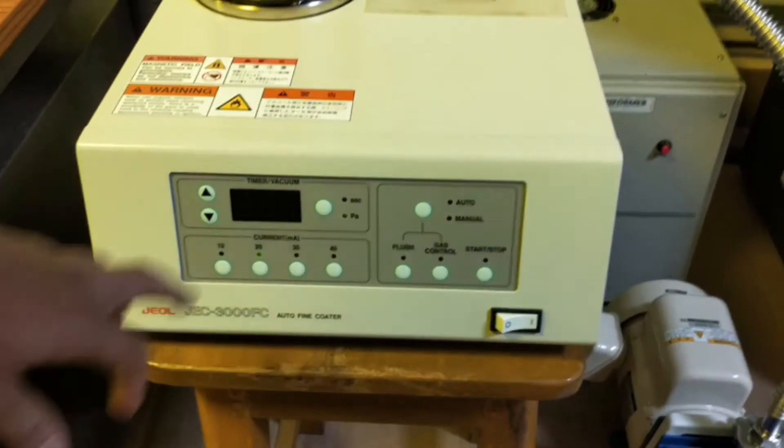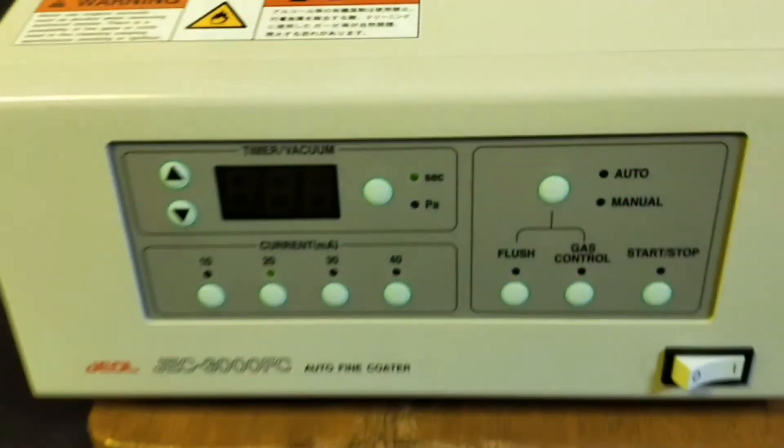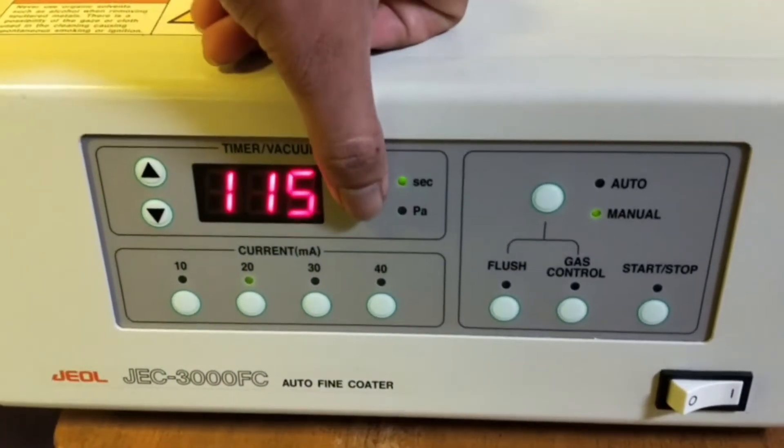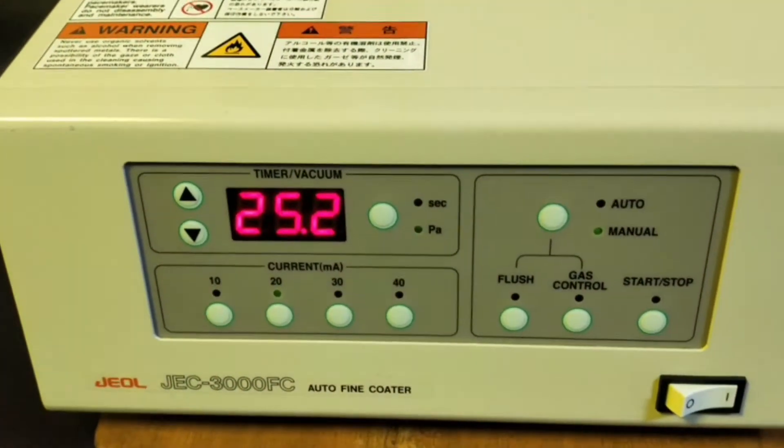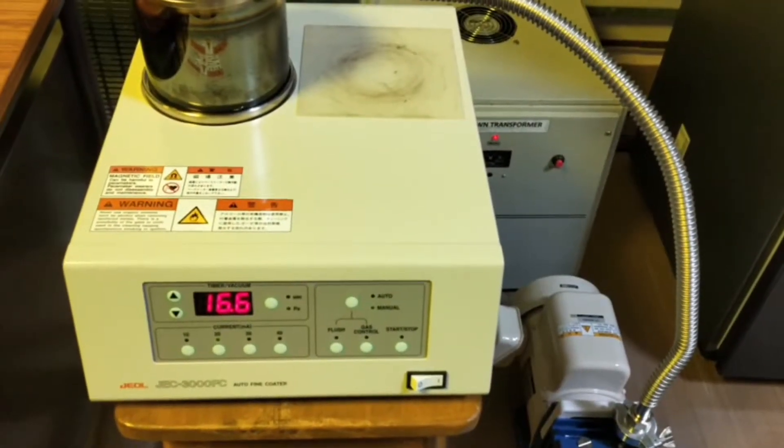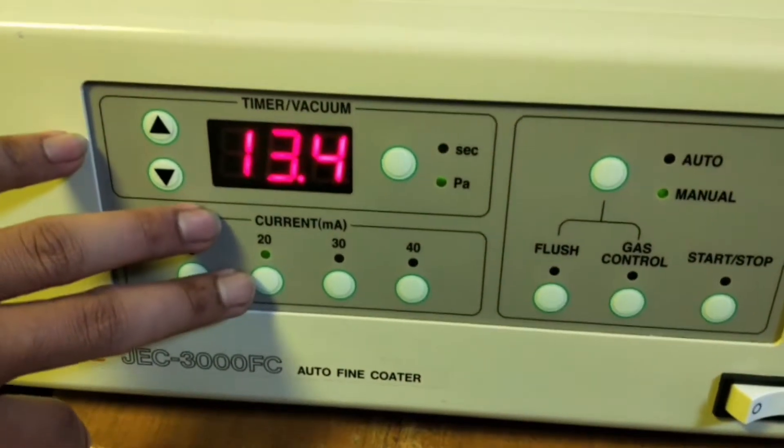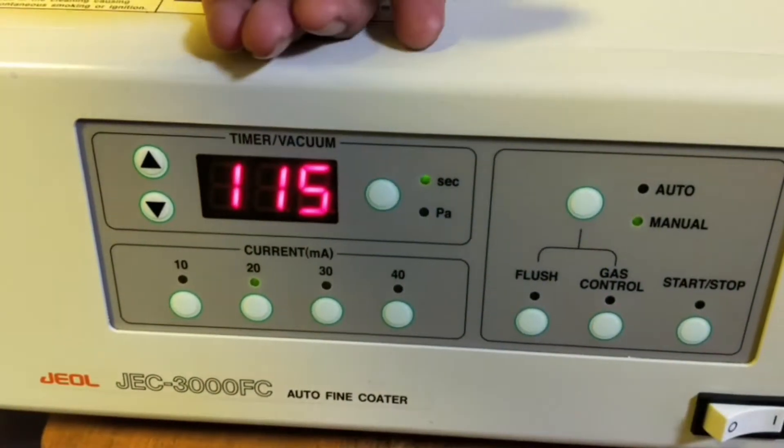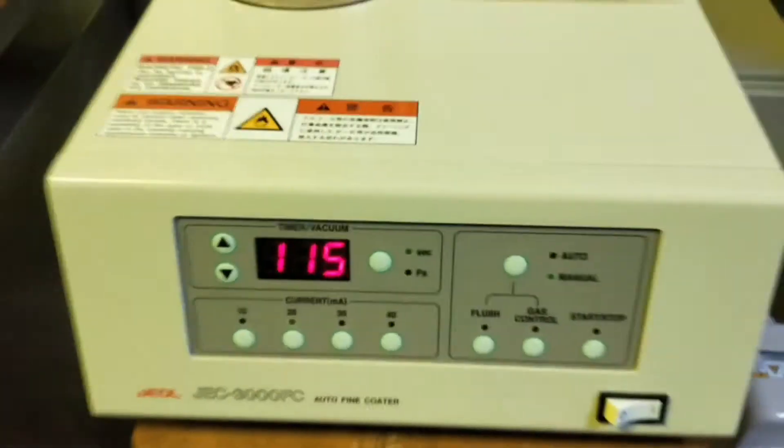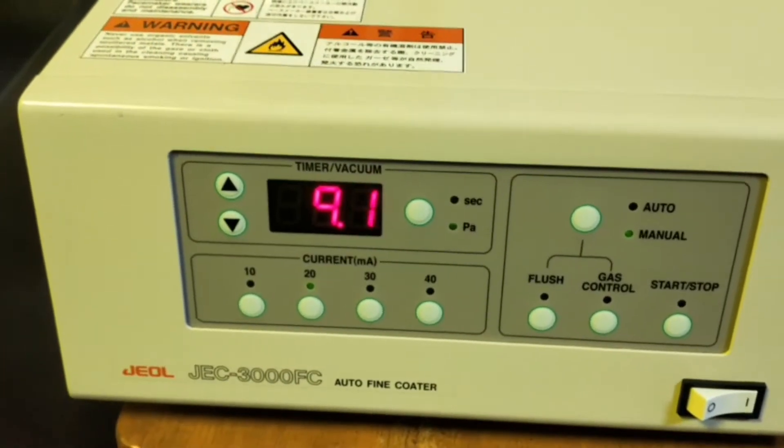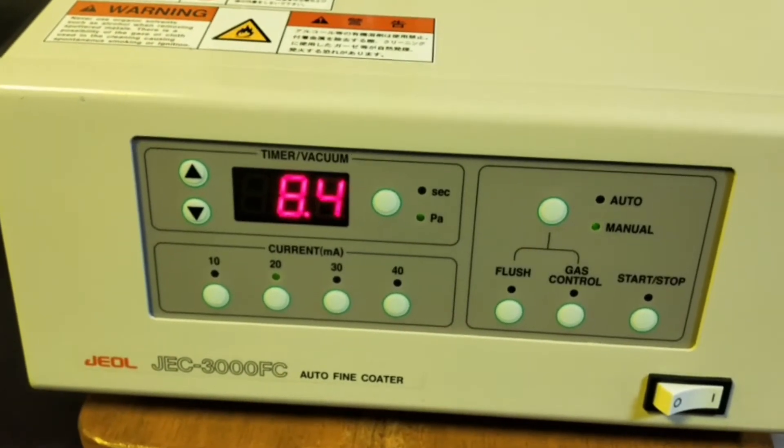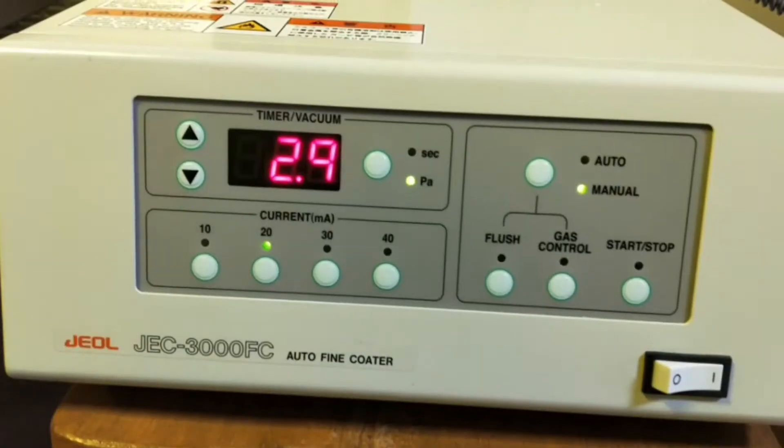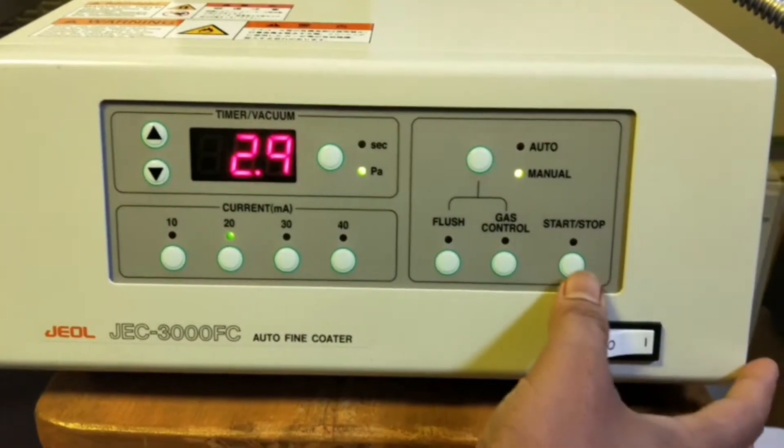There are certain parameters: current, pressure, and time. According to our requirement, the thickness of the deposited platinum, we have to set the time as well as the current. Generally we use 20 mA and the time in seconds we generally use around 90 to 120 seconds. After reaching a certain pressure, that is around 2.9, then we will start the deposition of the platinum on the sample. The pressure has come to 2.9, so we can start the deposition of platinum on the sample now.